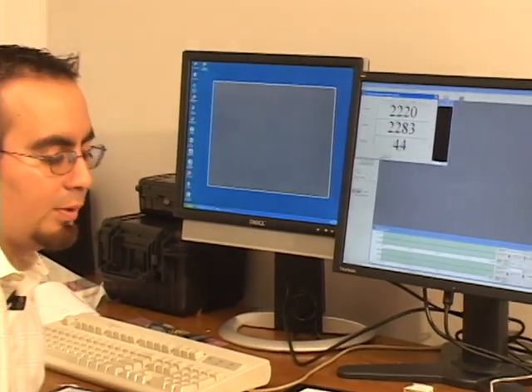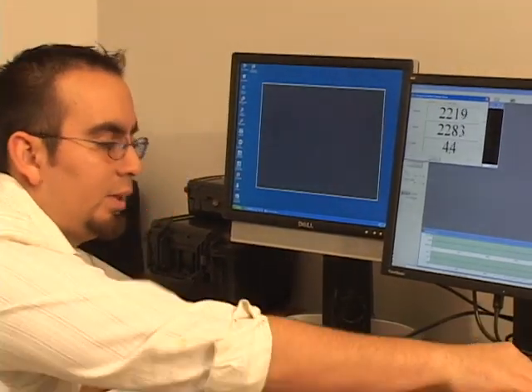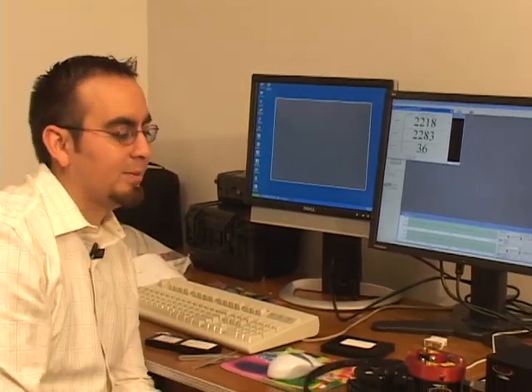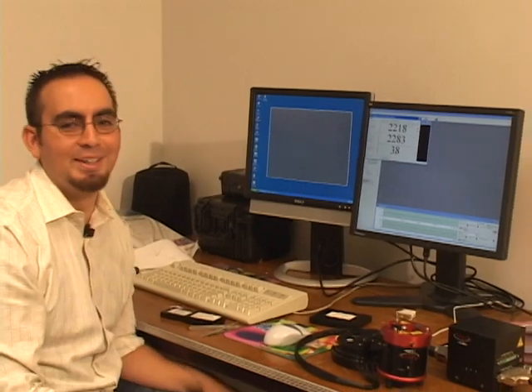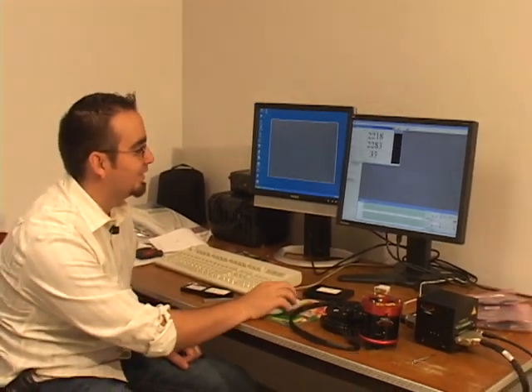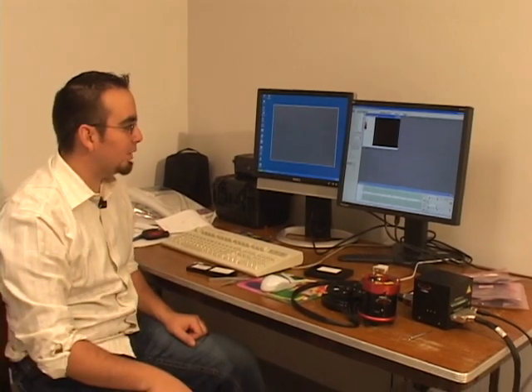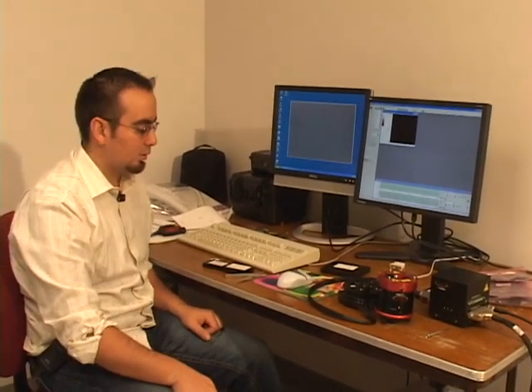You gotta be really careful with the pots on the brick here, because you can push them hard enough where you can break them, and if you break them, then you buy them. So we'll click close and we're ready to begin getting ready for contact mode.